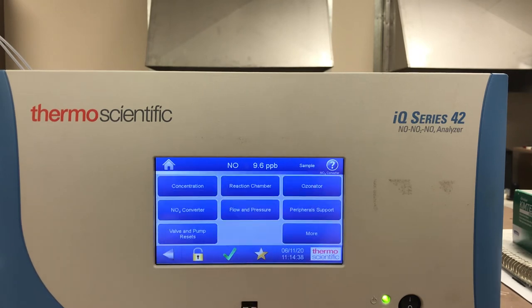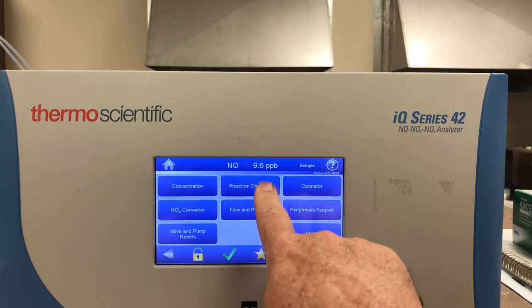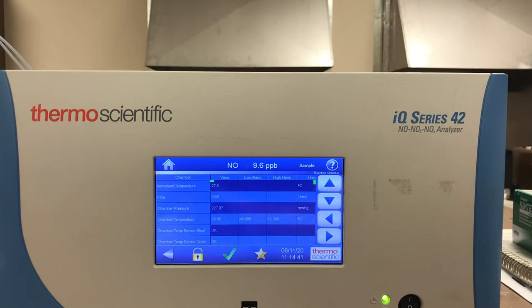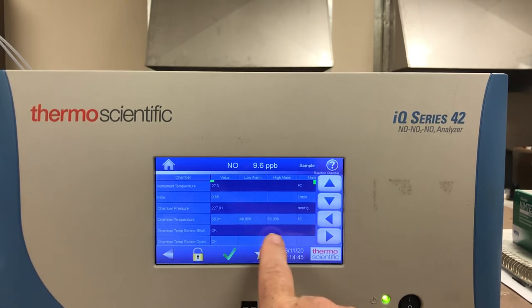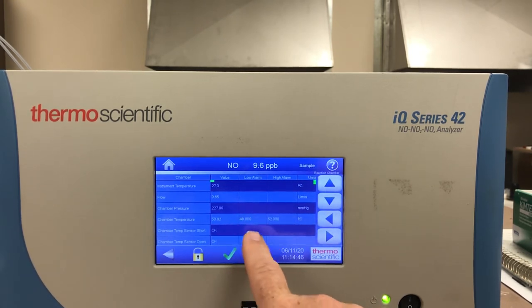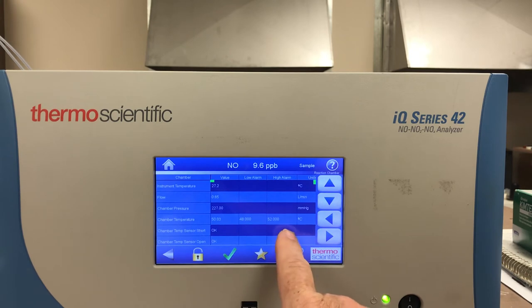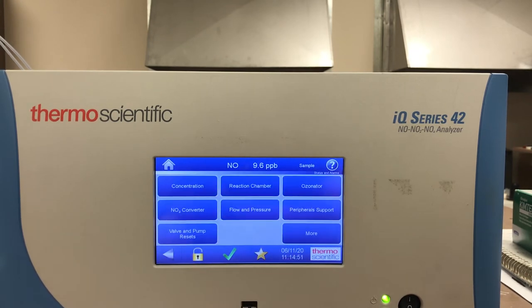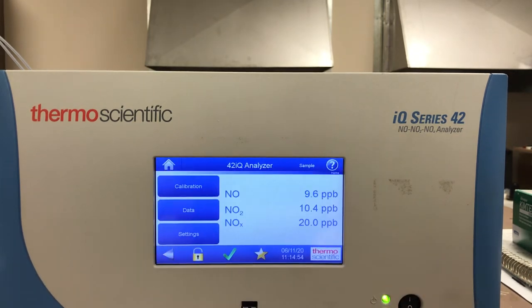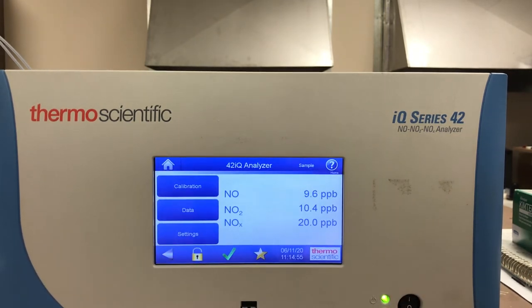But everything is good here and within maximum limits. I can go back and look at the reaction chamber temperature — everything is good in this case. If there was a high or low alarm, there would be a red indication for a low temperature or high temperature alarm. We press the home button to take us back to the main screen.